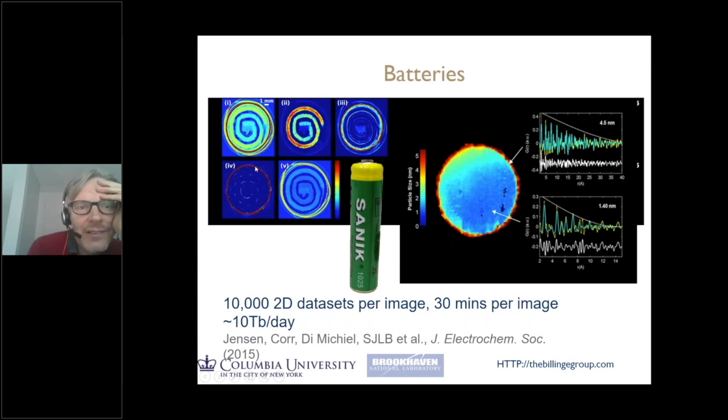And then we can take a signal that's coming from the steel in the material, and you can see the steel shell around the battery. But you can also see this dotted line here. It turns out the battery structure has the anode supported on a steel mesh, and this is the steel mesh that supports the anode, and we're mapping that. And then this one is coming from a polymer signal, so we're looking at where the polymer is in the material. There's a lot of polymer on the outside of the sample, and that's the polymer covering with the branding on it.